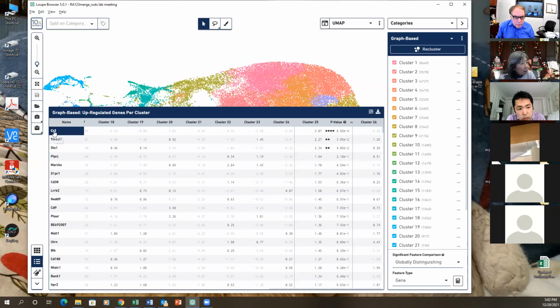So what's that? That's a marginal zone. CR2 is CD21. It's only 3 genes, so it's a subset of marginal zone. Is S1P1? You know, that's one. That's good because that's the one that interferon acts on. And you know, we showed that. That's the one. I think it's marginal zone with CD9. That's marginal zone. Yes, it is marginal zone.